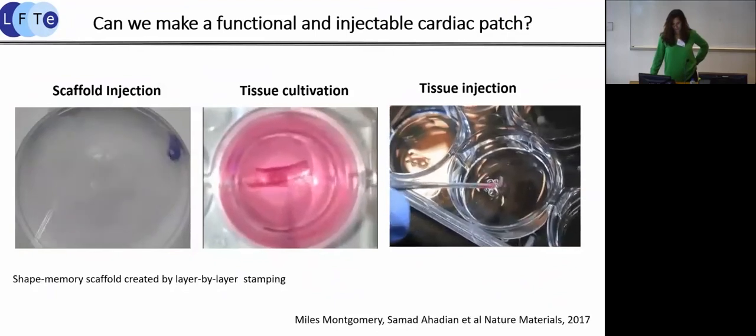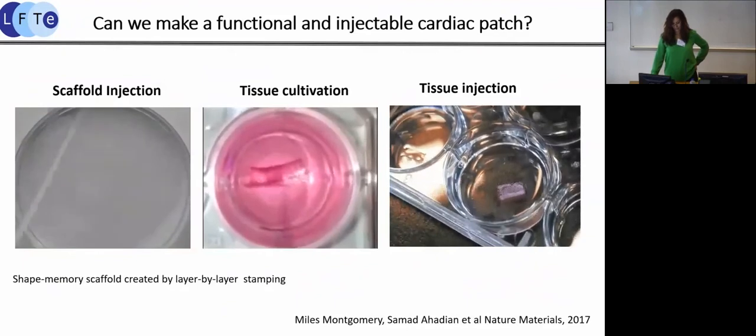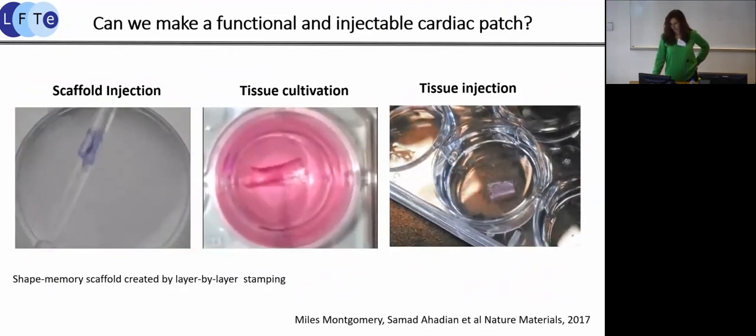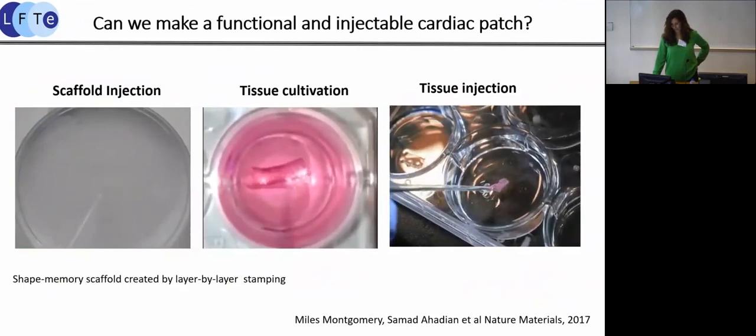And you can see that it's opening up after injection. We can cultivate the tissue and it's going to beat. And then we can also deliver an actual tissue, which is shown in the last slide right here.